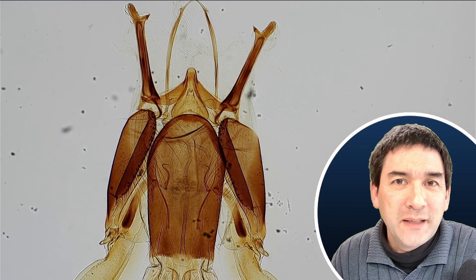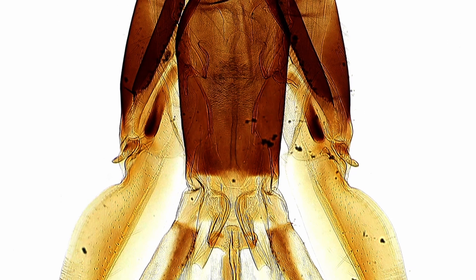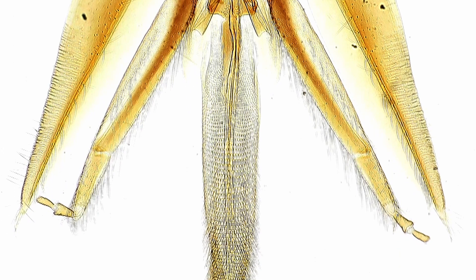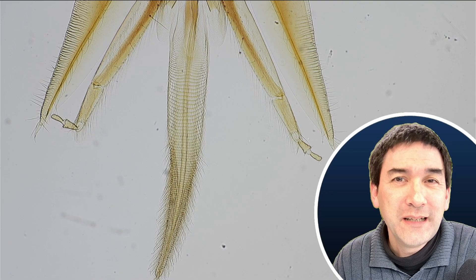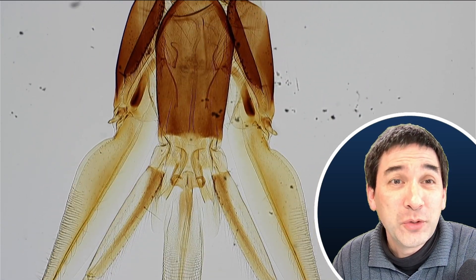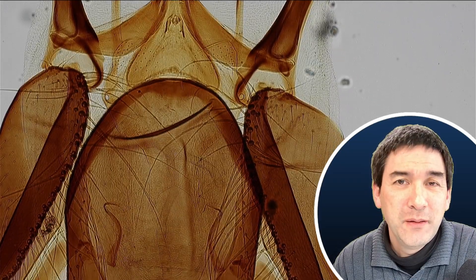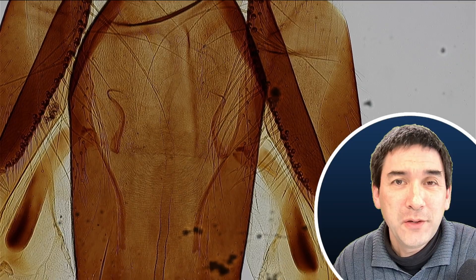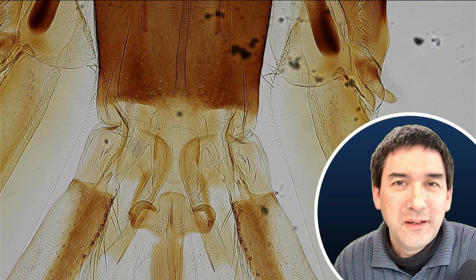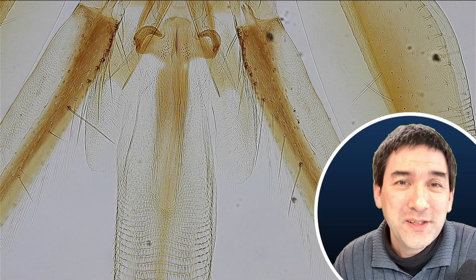This is how it looks like at a low magnification. I'm using my four times magnifying objective. It's a very symmetrical structure, evidently. There are many tiny little hairs growing on this structure. I'm going to go up a little bit with the magnification. Maybe if you already have a suggestion, leave your comment in the comment section below.